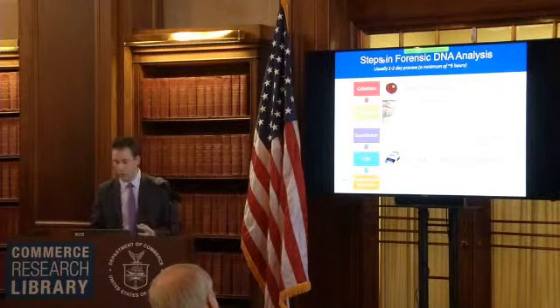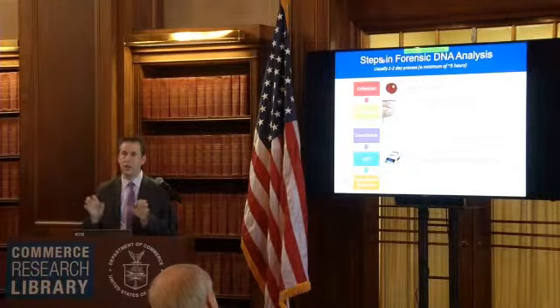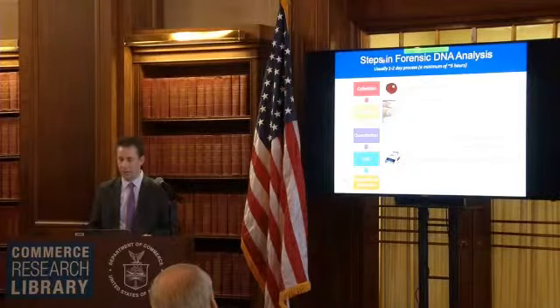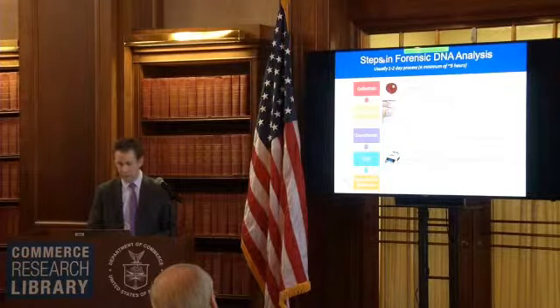And I'll show how that works in a minute. So you have your full genome, but now what you're doing is just putting in targeted sequences to help amplify the STR regions that you're interested in. You also label those with fluorescent dyes for detection.